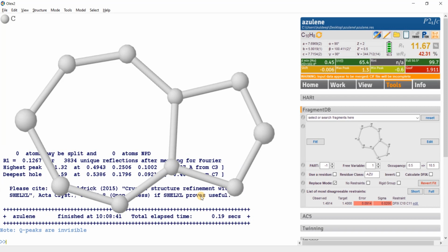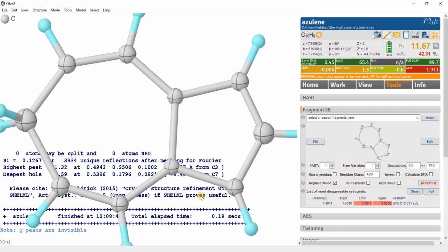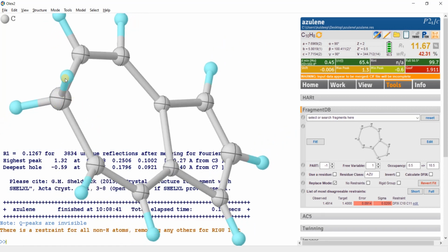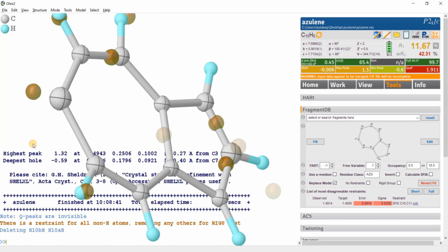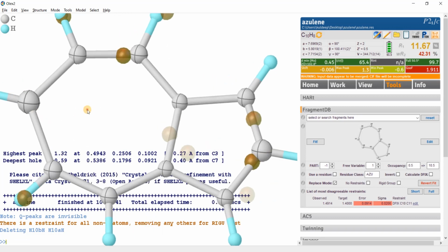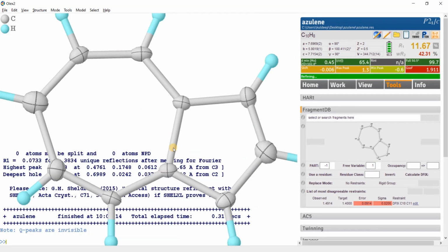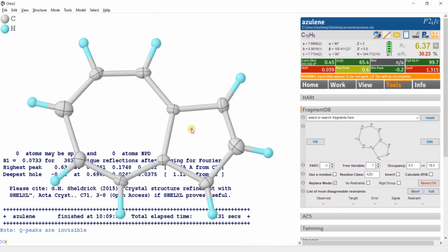and next step is anisotropic refinement, then hydrogen add, and then RIGU, and you can see this carbon atom is taking 2 hydrogen, which is not reasonable. Just delete it, select this one and type HADD 43, and it will add the 1 hydrogen. Now refine it by just pressing Ctrl R, and you will get the R factor is around 6.3%. Refine one more time until the shift gets stabilized.